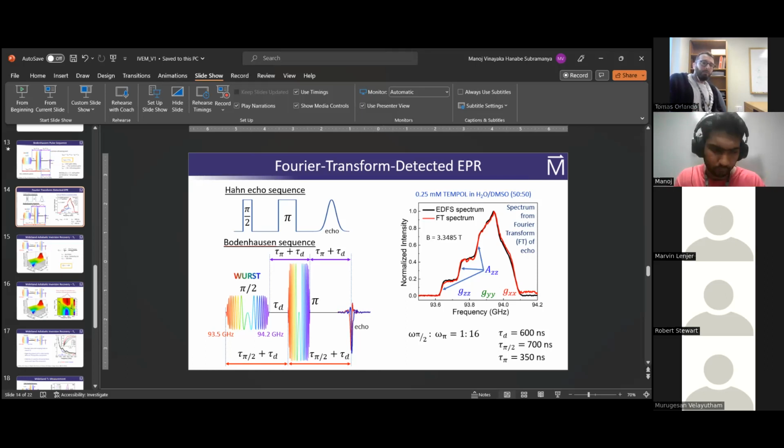So the question is really the size of the echo. If you excite all the spins ideally, and you don't have... Oh, I see. You mean like here? Yeah, that you might expect to have an enormous echo. Obviously, it's difficult to tell from that spectra, but that's not our experience. It was very, very much down on what you might expect.